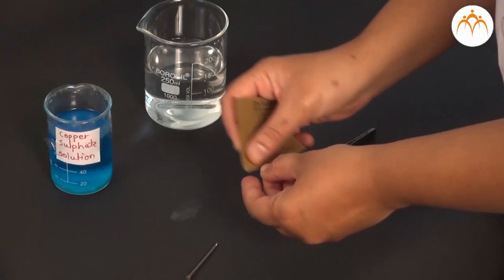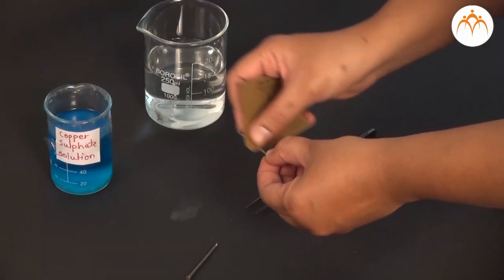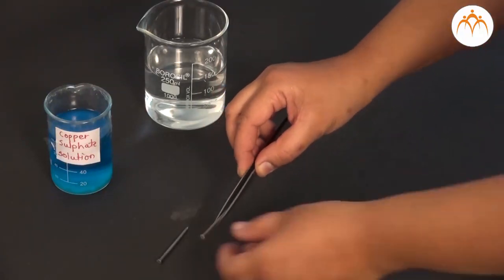Displacement reaction: Reaction of copper sulphate solution on iron nails. Take iron nails, free from rust. Clean it with sand paper and wash with water.